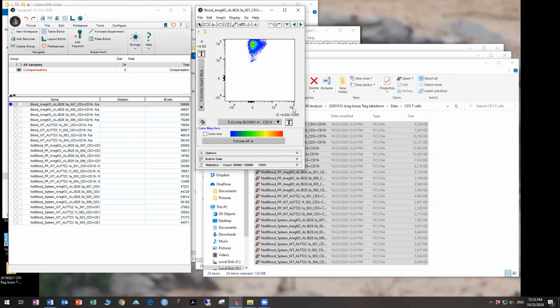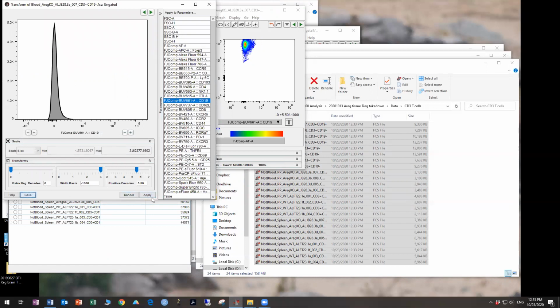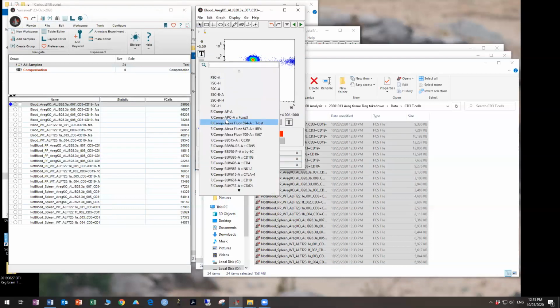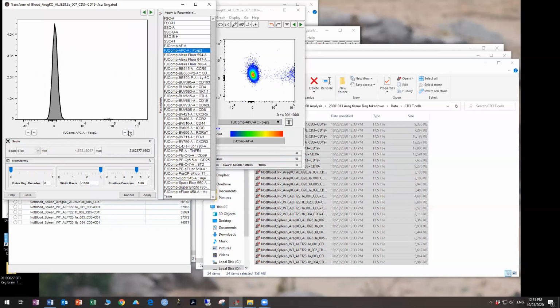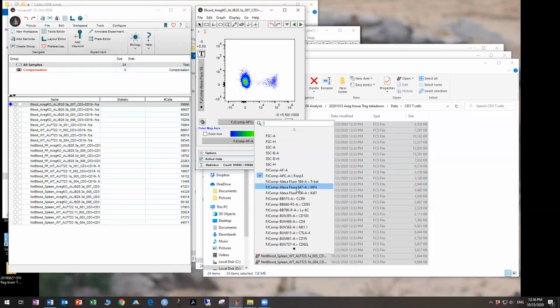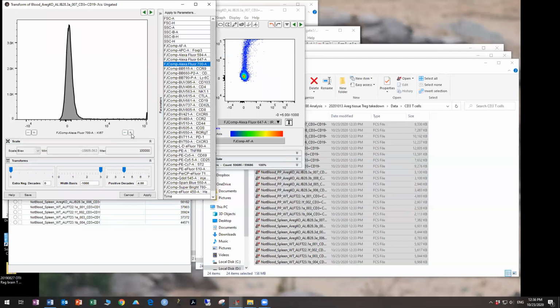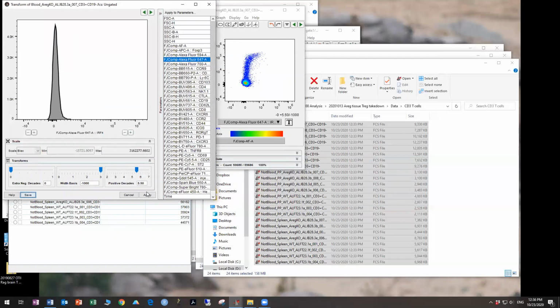You can also see that our data have now been transformed to be only 10 to the 5, which is something we don't want. So ideally, we need to actually go through and correct this, because otherwise these data are going to get cut off in R, and everything on the axis will read as the same. So unfortunately, you may need to do this for each individual parameter. And some of them it has kept for some reason, and others no, and I don't know why this is. This will probably be different on each machine.